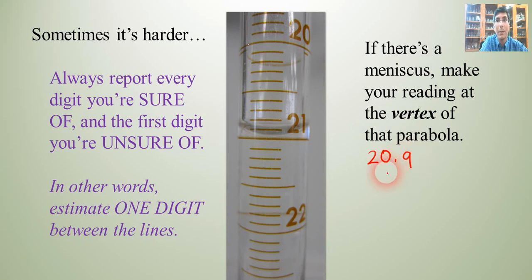Well, the rule is you want to estimate one place, and so that means you really have to squint. You really have to read between the lines there, and it looks like it's almost right at halfway between there, maybe a little bit closer to the 21 point zero, depending on how you see that. So, I'm going to guess it's about 20 point nine six milliliters, and let's see how I did. Oh, looks like I got it right on. So, that's the reading of this burette.